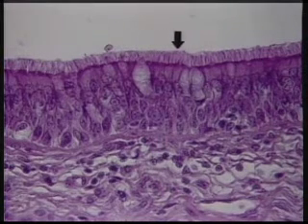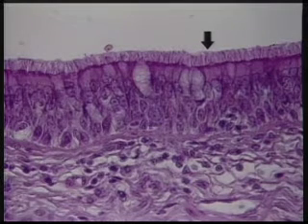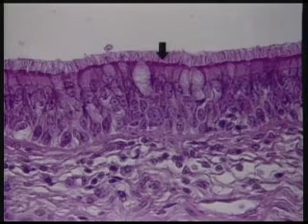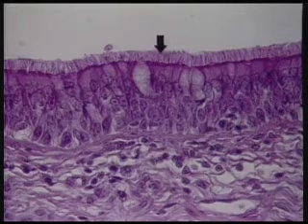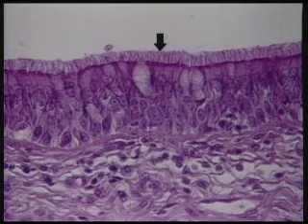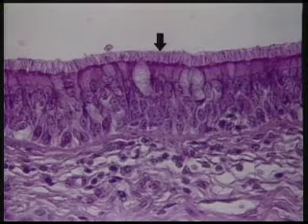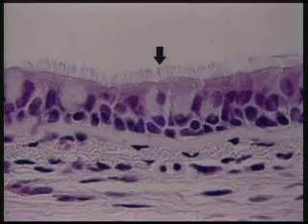This is the surface of the epithelium of the trachea. It has a whole group of cilia. The cilia look kind of like the bristles of a brush. The cilia would extend from the epithelial surface here right out to about here. Each cilium is a little too small to see with the light microscope. It measures about 2/10 of a micrometer in diameter, which is the resolving power of the light microscope. But let's have a look at another image and see how these cilia look at higher magnification.